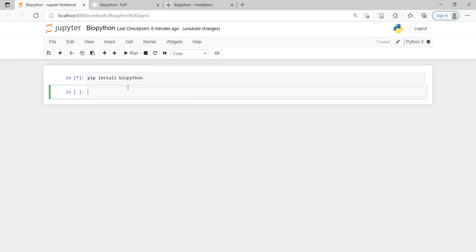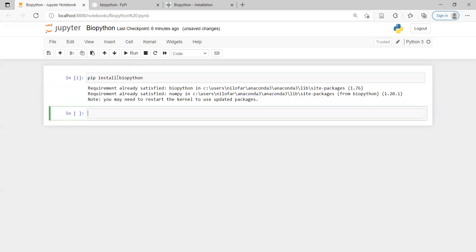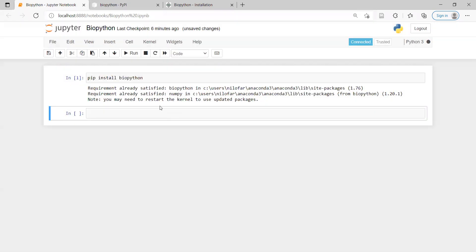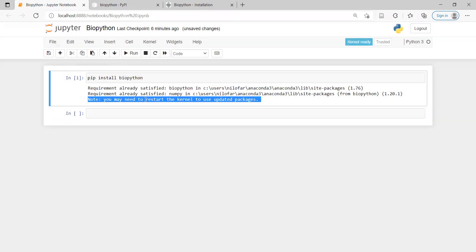Once you do that, you will see that it has started running and it has successfully installed in my system. Then I'm going to reset the kernel because it has been mentioned to do so, and I have done that.